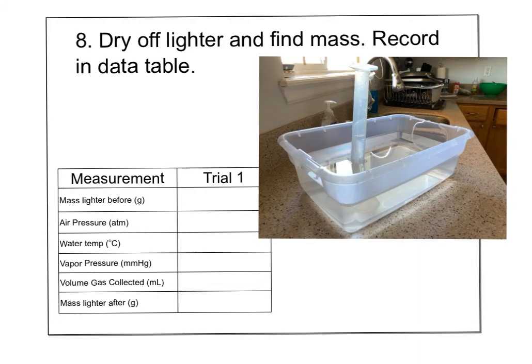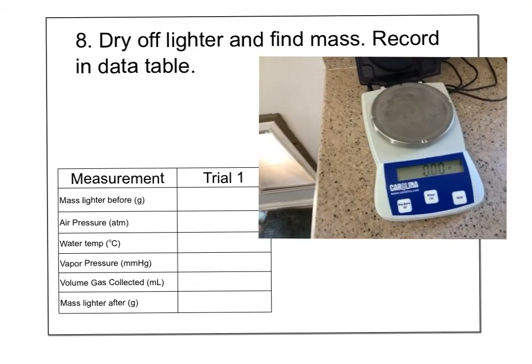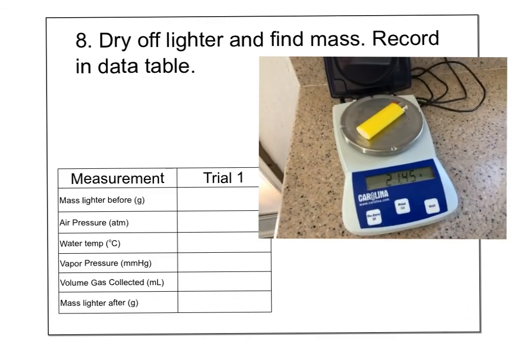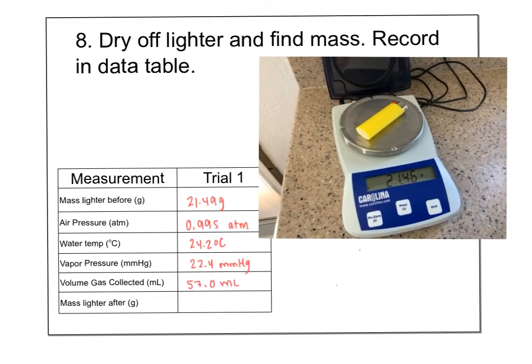Blowing to get any remaining water droplets out, then zeroing the balance. The lighter after reads 21.45 grams. The display briefly showed 21.46 but it's hovering at 21.45, so we'll record 21.45 grams as the after mass.